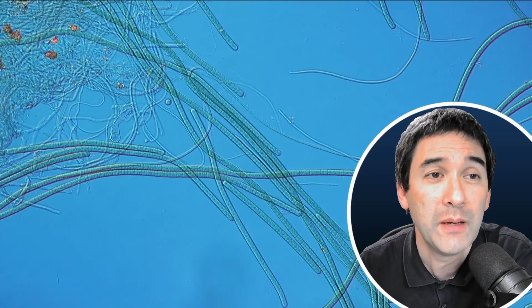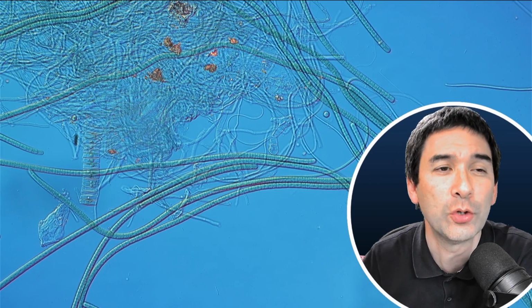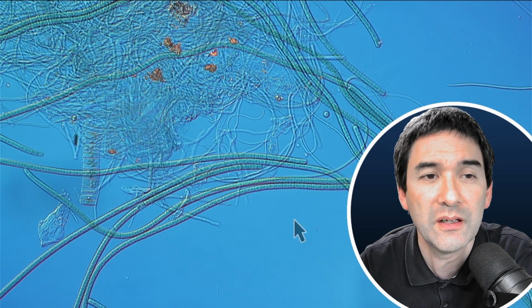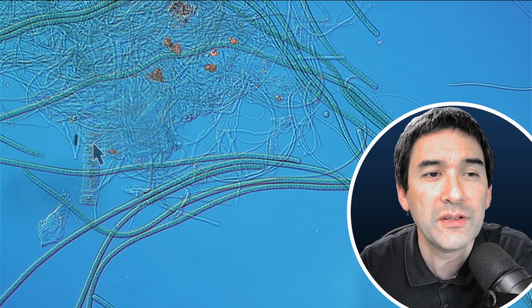Yeah. Over here, we can also see that evidently there are also some diatoms over here. So just also want to show that to you. You see that some of them are much thinner filaments, and those here, these are diatoms.